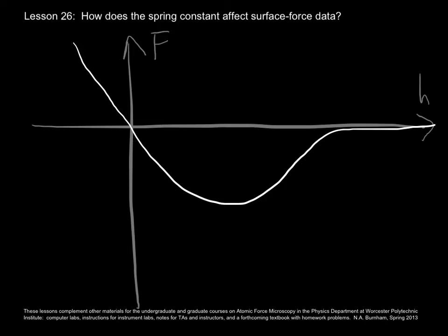In Lesson 26, we'll talk about how the cantilever spring constant affects surface force data. And I'm going to pull in ideas from many previous lessons about van der Waals forces, about capillary forces, about interaction potentials, the instabilities, equilibria, etc.